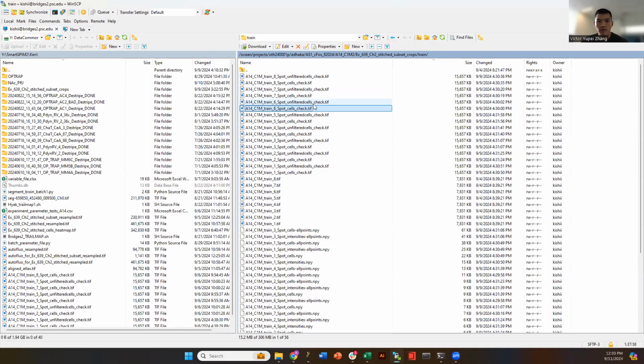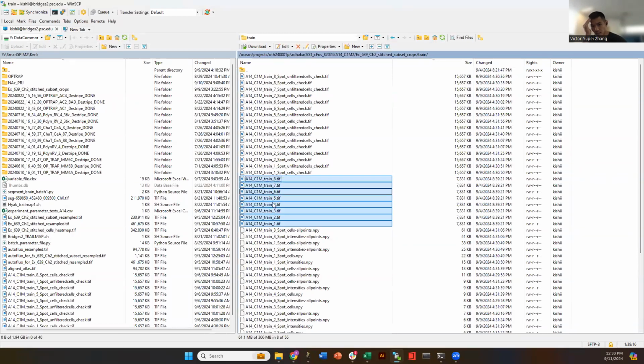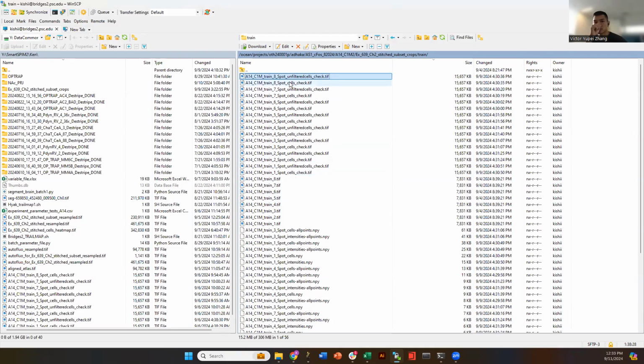Okay, but I won't have files that have the crops though, right? I'll just have the check files, the cells check files. I won't have the TIFFs that are the Z stack of the crop. Is that correct? So these ones that I'm pointing to right now were the original cropped images. Those will be used to test the classifier, and then each file will have the results file saved as well, and these will be the results files.